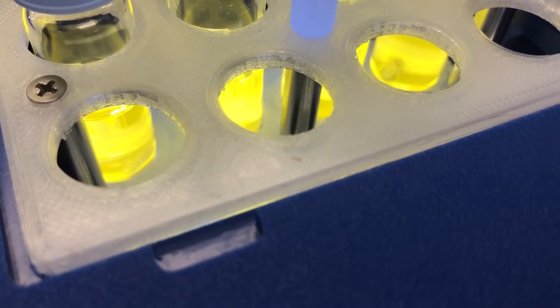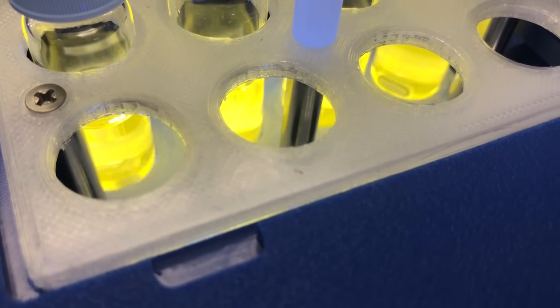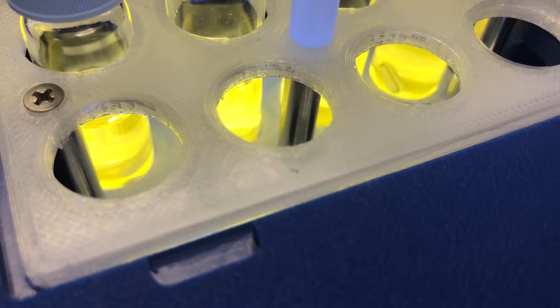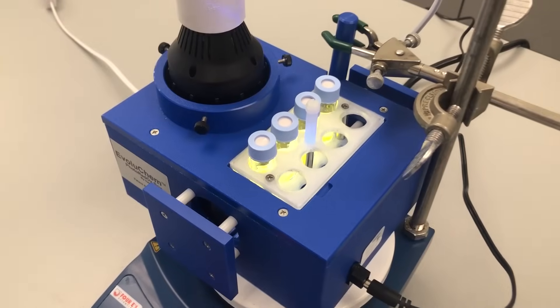As you can see, the stirring magnets are being engaged by the stirring plate and spinning at the preset speed, which is easily adjusted on your stirring plate.